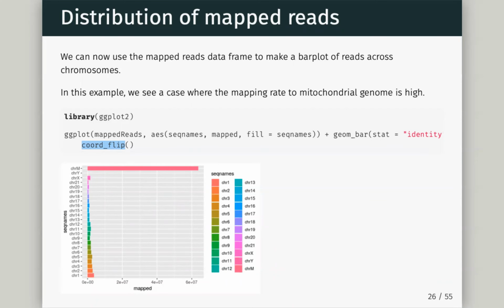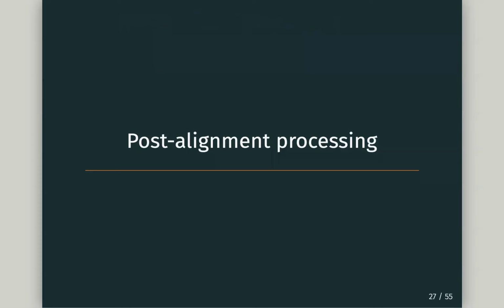So this is the first thing you can check to see if your ATACseq worked. It's the first thing people ask me to check for them. And then hopefully with the new methods on the ATAC, etc., you shouldn't see this much. It's also a QC metric for single cell ATAC as well.